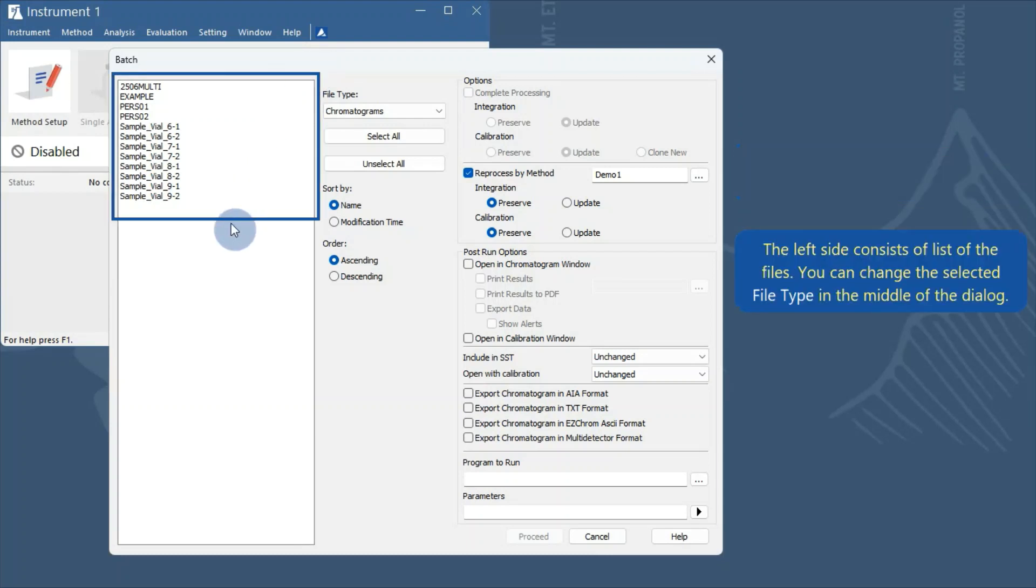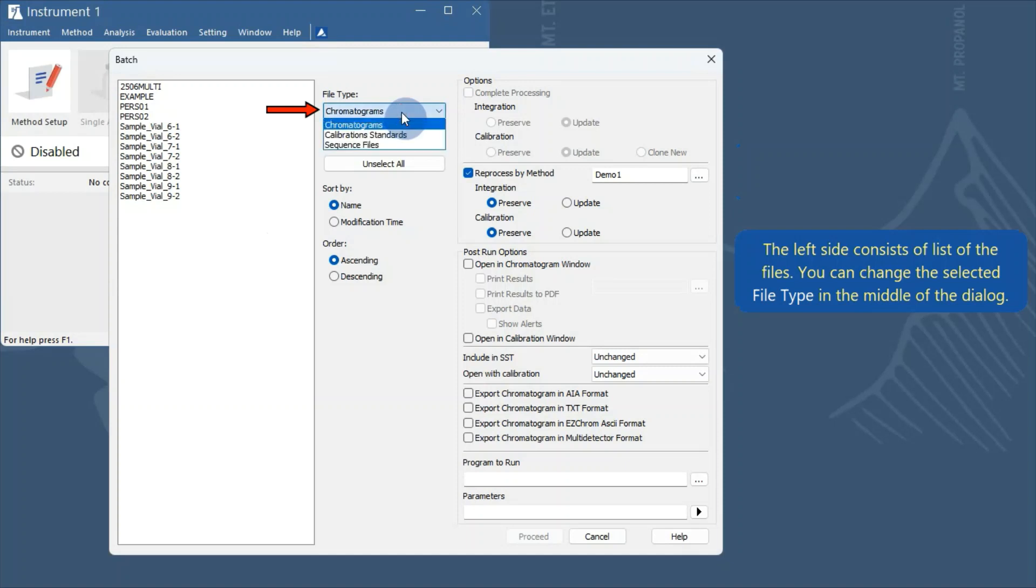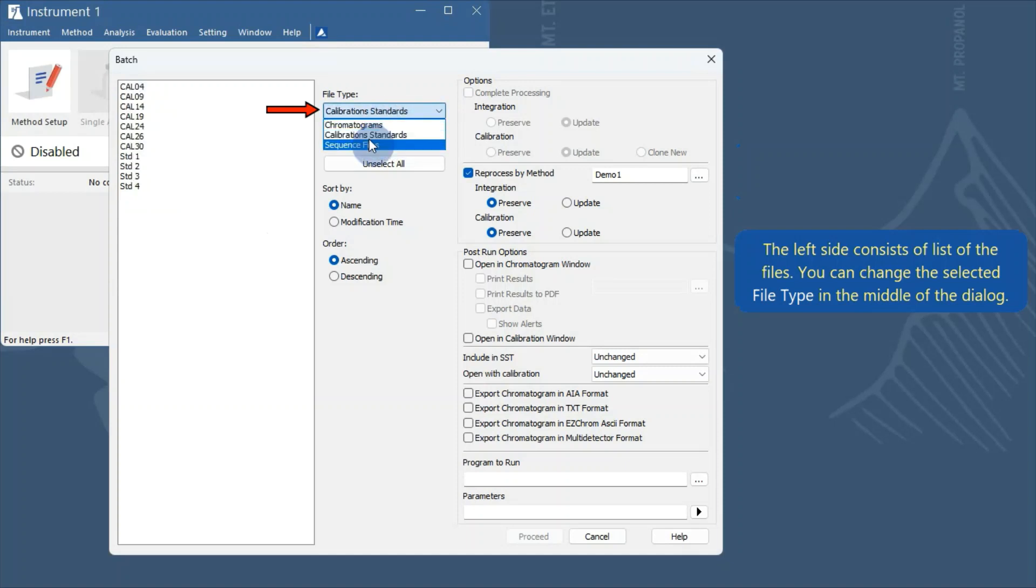The left side consists of a list of files. You can change the selected file type in the middle of the dialog.